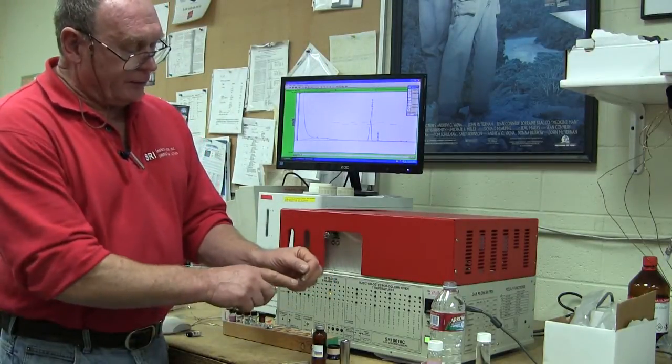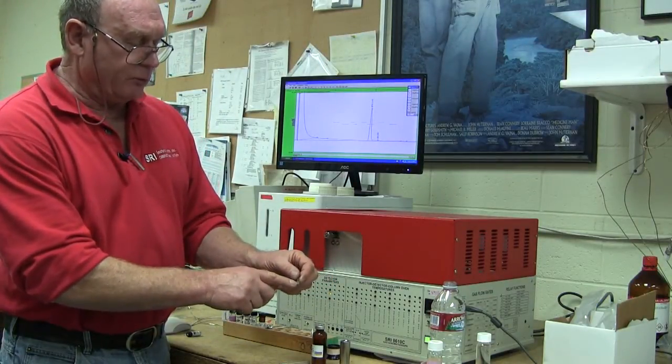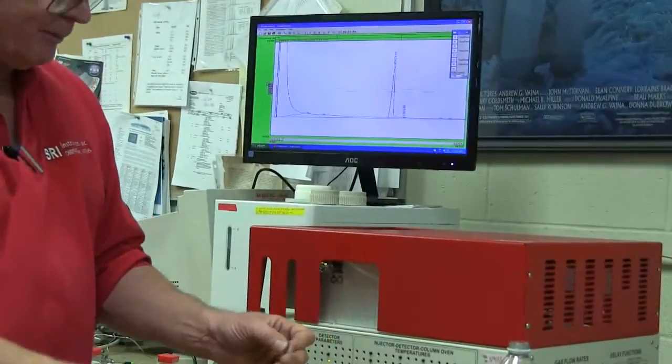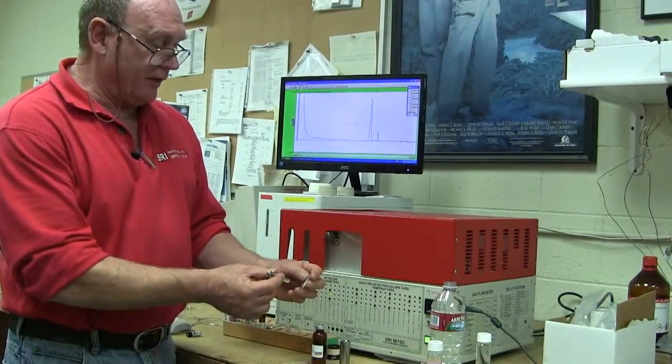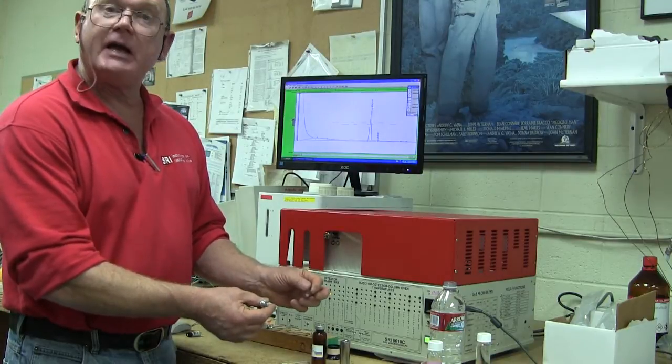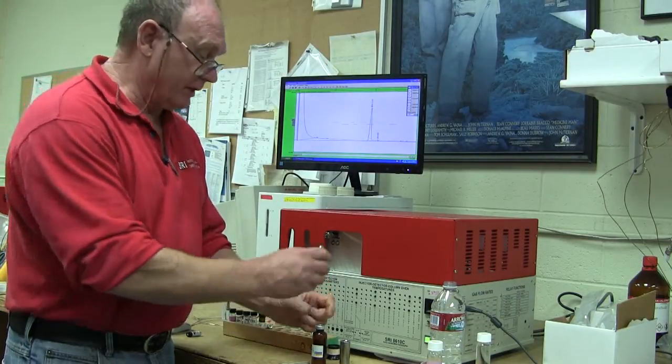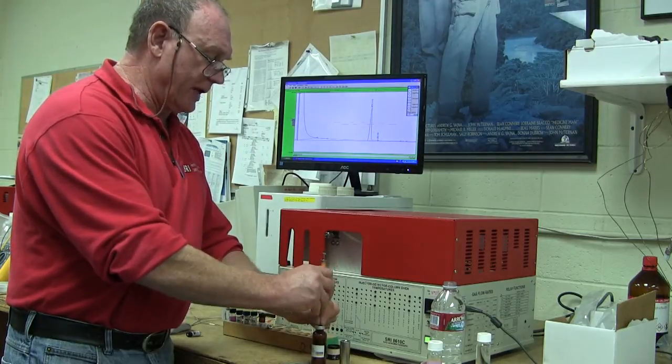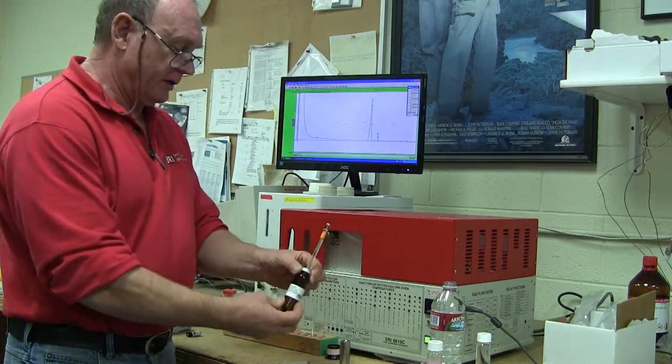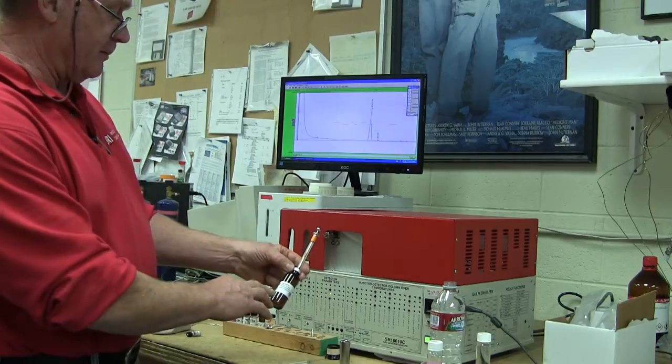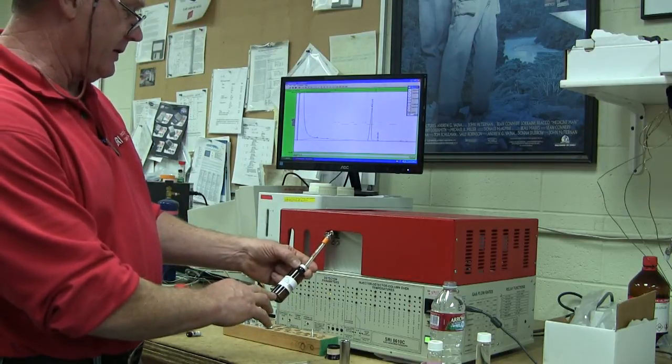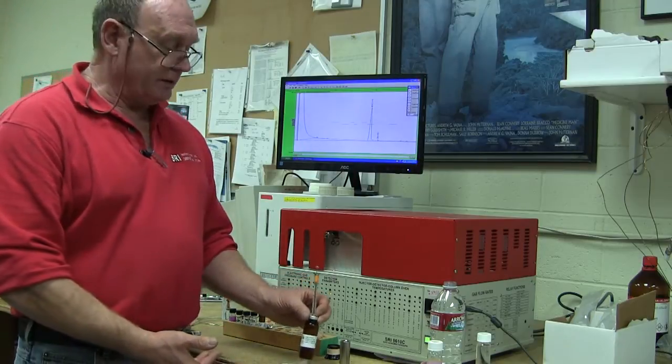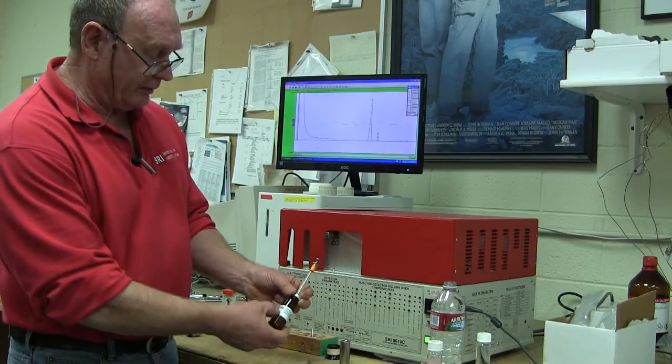So once the methanol is evaporated, you'll see that there'll be a little white or brownish kind of a sludge in the bottom of the 200 microliter vial. So we're going to re-dissolve that sludge, which is the THCA or the three cannabinoids, and we're going to dissolve it in a derivatization reagent called MSTFA, which is a very long chemical name for N-methyl-NTMS trifluoroacetamide, but we just abbreviate it as MSTFA. So you can buy this from Restec.